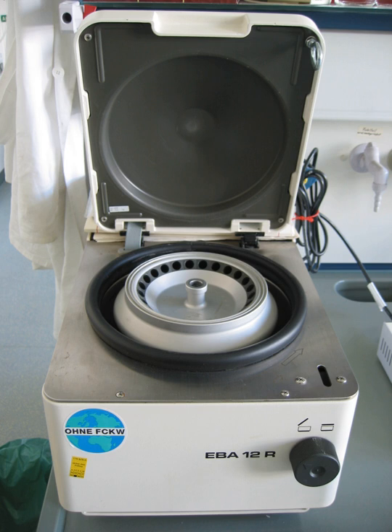Another potential hazard is the aerosolization of hazardous samples during centrifugation. To prevent contamination of the laboratory, rotor lids with special aerosol-tight gaskets are available. The rotor can be loaded with the samples within a hood and the rotor lid fixed on the rotor. Afterwards, the aerosol-tight system of rotor and lid is transferred to the centrifuge. The rotor can then be fixed within the centrifuge without opening the lid. After the run, the entire rotor assembly, including the lid, is removed from the centrifuge to the hood for further steps, maintaining the samples within a closed system.